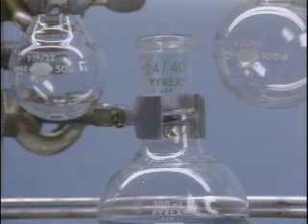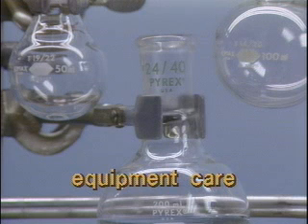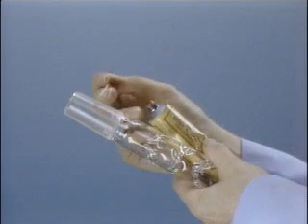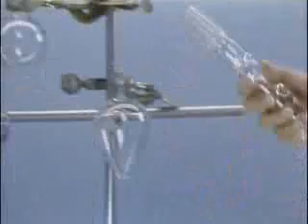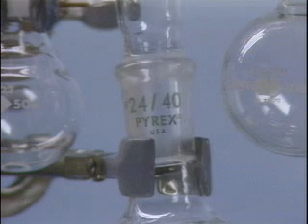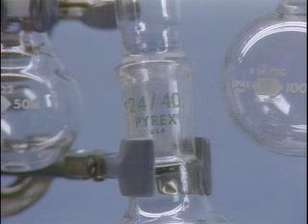Very often, glassware with standard taper ground glass joints is used in the organic laboratory. Because of the precision required to manufacture this uniformly sized equipment, it is very expensive. Care must be taken at all times when using this glassware. Depending on the conditions of the experiment, it may be necessary to grease the joints before the glassware is assembled. This grease provides a tighter seal for the joint. However, one runs a risk of contaminating the reactants or products whenever grease is used in the joints. If you are instructed to grease the joints on your glassware, a very light film should be applied evenly over the full ground glass surface.